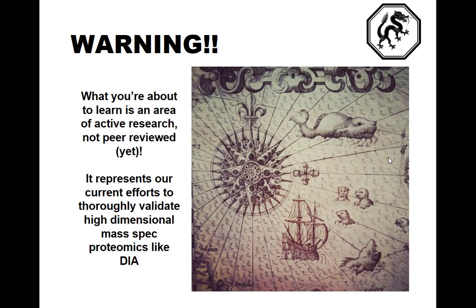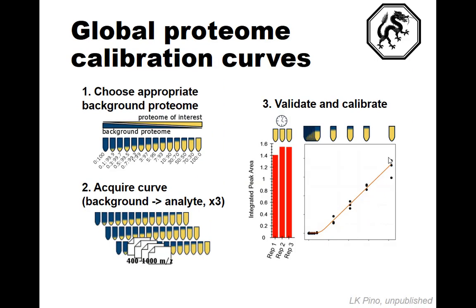So I want to put a big warning here, right? Because we're in uncharted territory at this point. This is academic, ongoing, active research. It is not by any means the only way that you could do this, but this is the way we are doing it in our lab. So you would first choose your appropriate background proteome, and you would dilute it in.